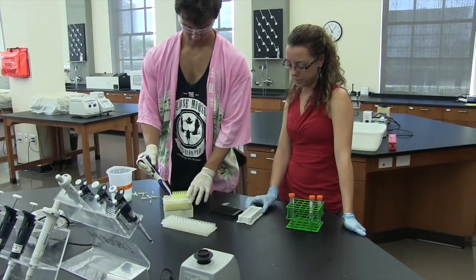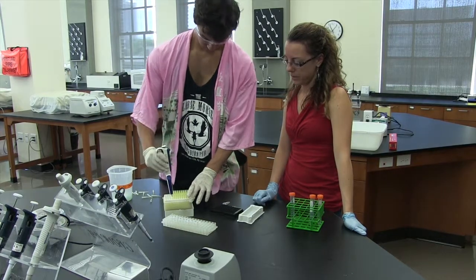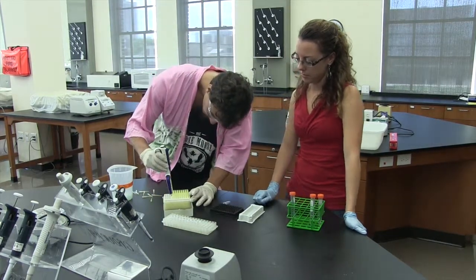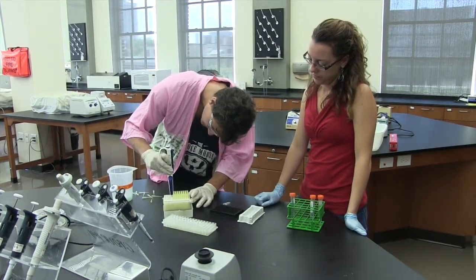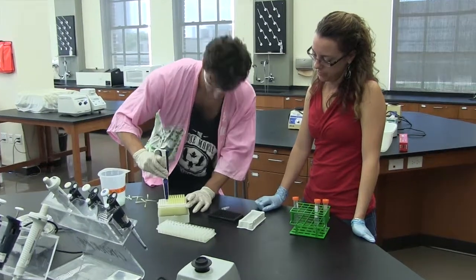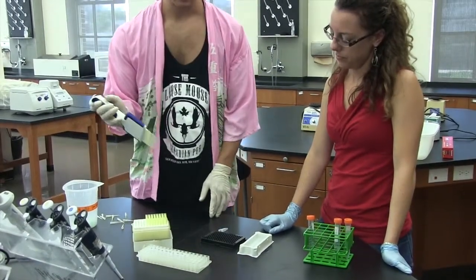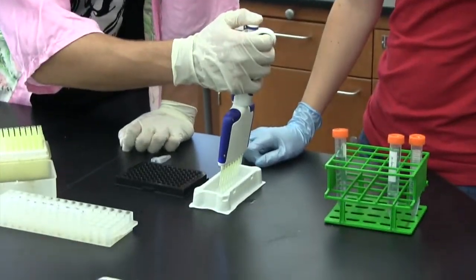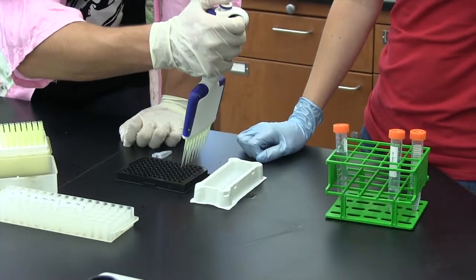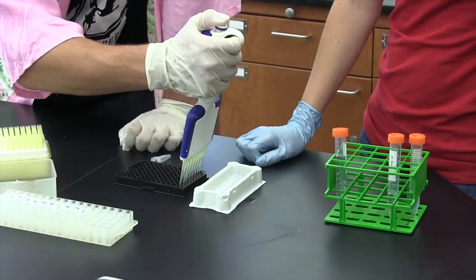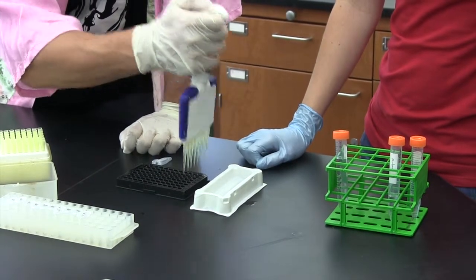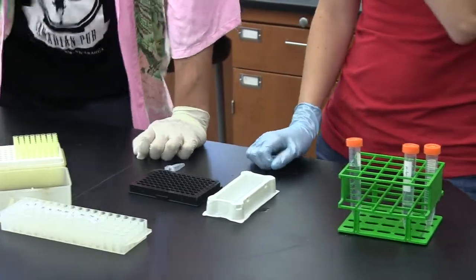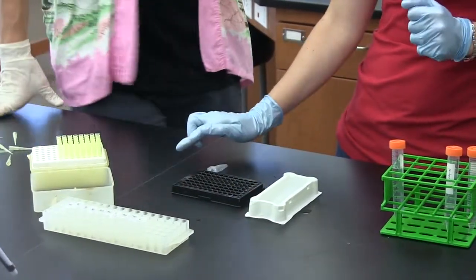So I have the first urea solution in here and I'm going to do the same thing. Just making sure all the tips are on all the way. You've got to push down kind of hard, but not too hard. And then just the same thing, except we're going to be going in columns now with the urea samples. Exactly the same all the way across the plate.